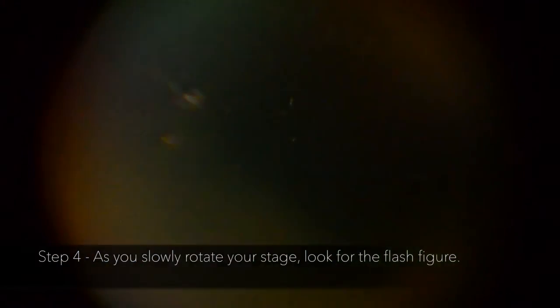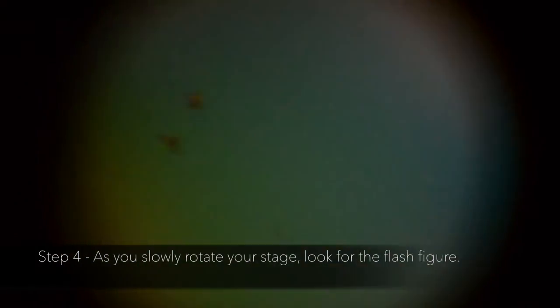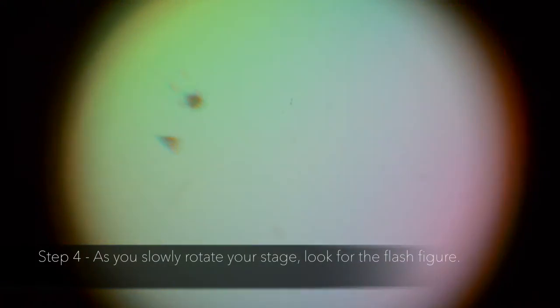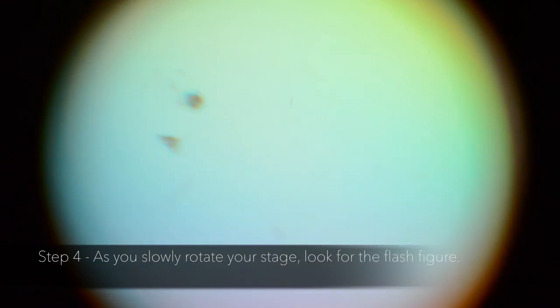Step 4: As you slowly rotate the stage, your figure should become extinct and then illuminate itself, similar to a uniaxial flash figure. Here, I am only rotating the stage by very little, only a couple of degrees. You may be able to see a faint thick cross appear and disappear as you rotate your stage. This is unique to biaxial minerals.